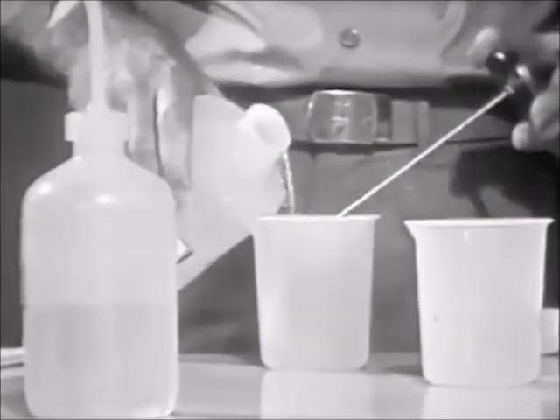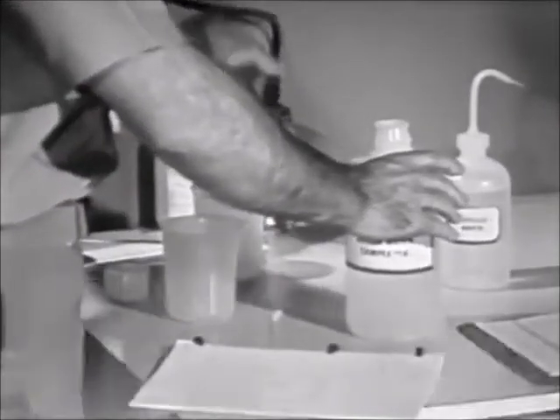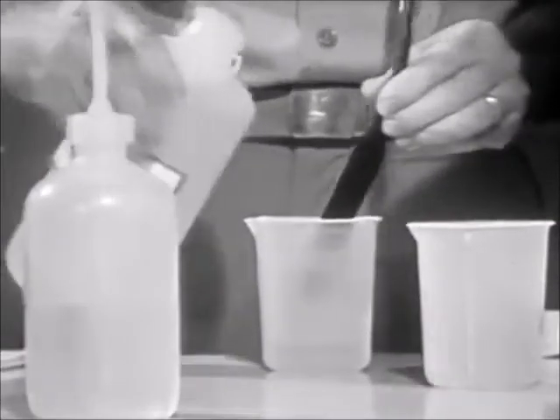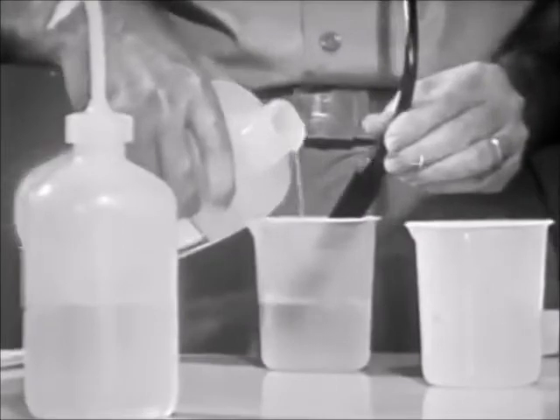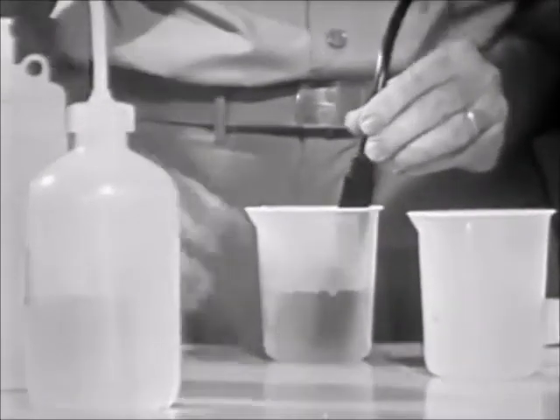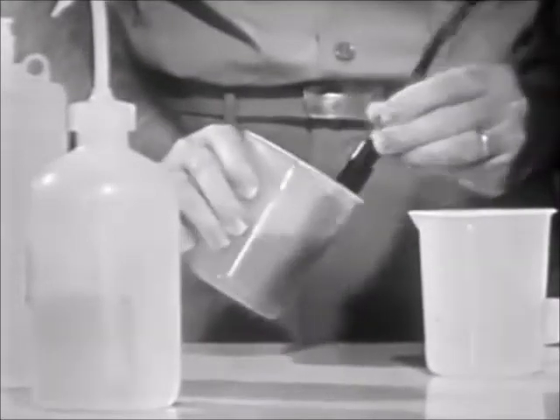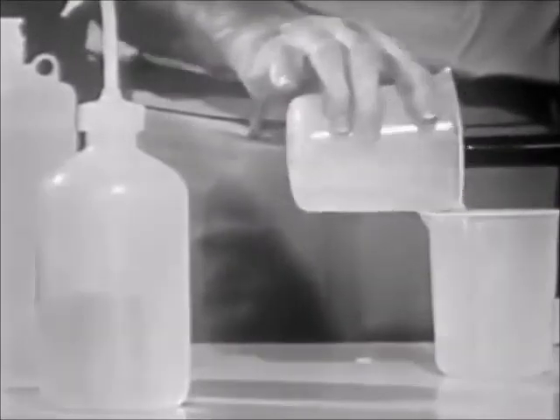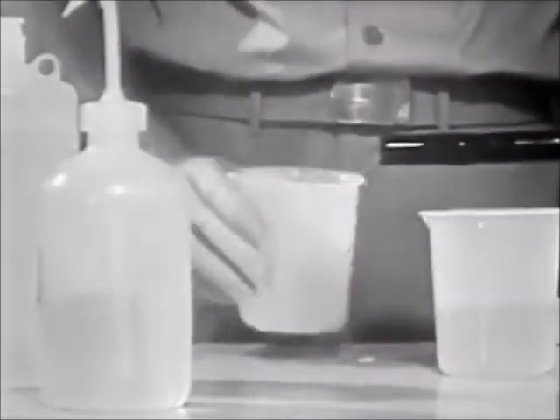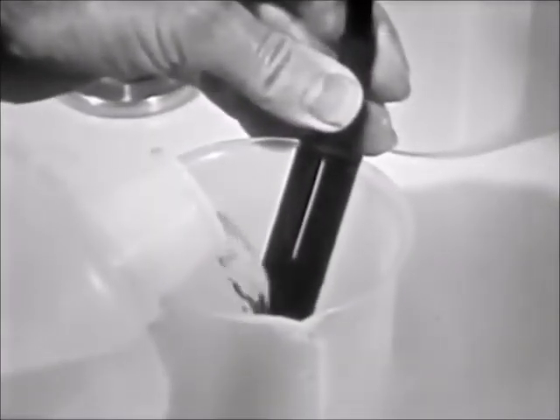Rinse the thermometer, cell, and test beaker with some of the boiler water sample to be tested, and discard the rinse. Place the cell in the beaker and pour at least 200 milliliters of sample water into the beaker.